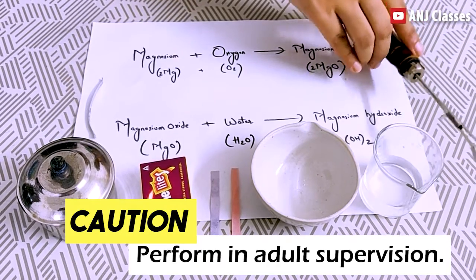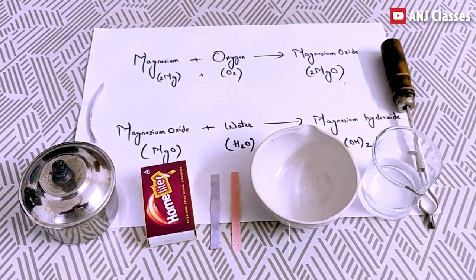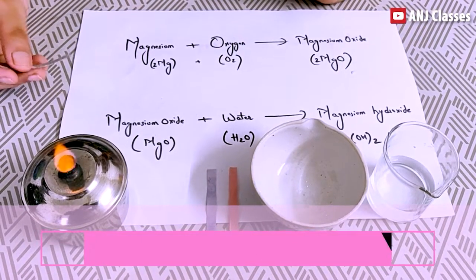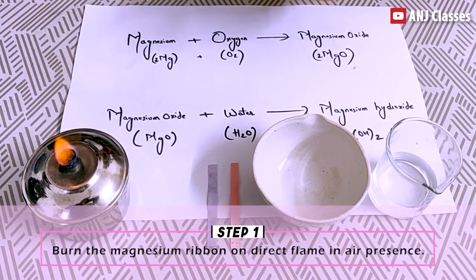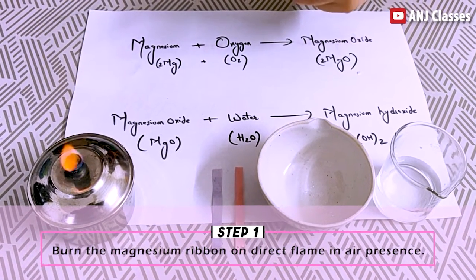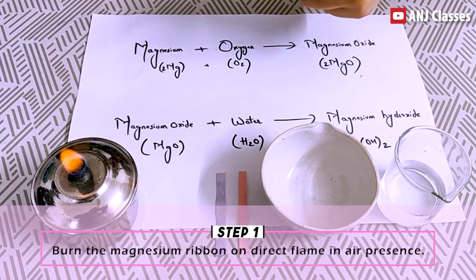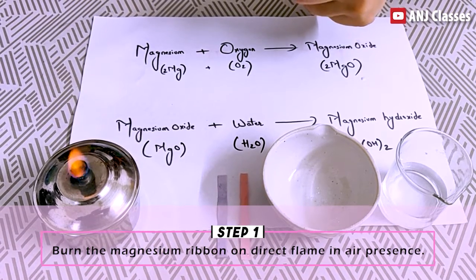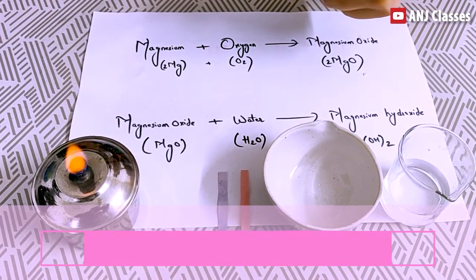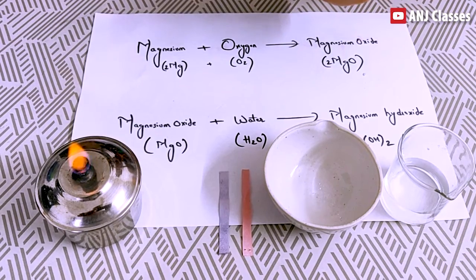Now I have lit my spirit lamp. Now with the help of test tube holder, I'm going to hold my magnesium ribbon and I will place it near my spirit lamp.